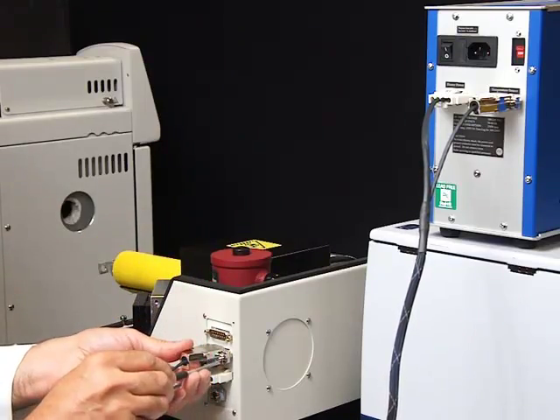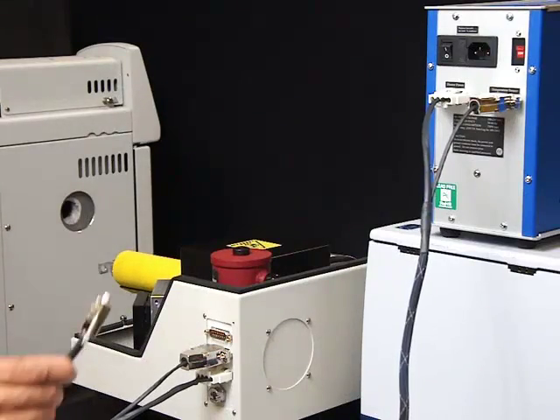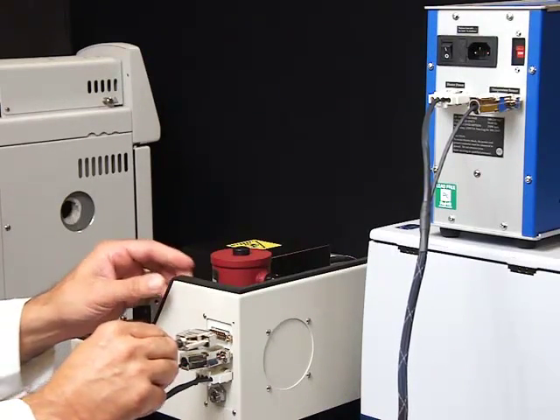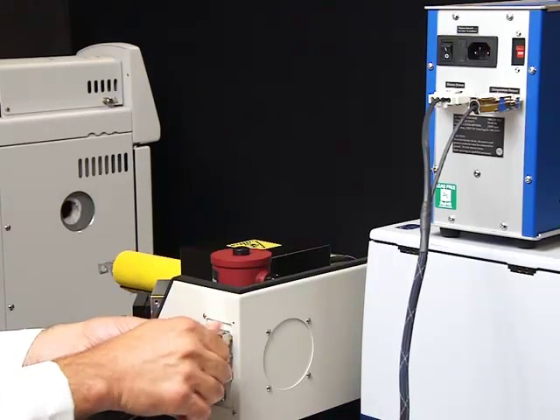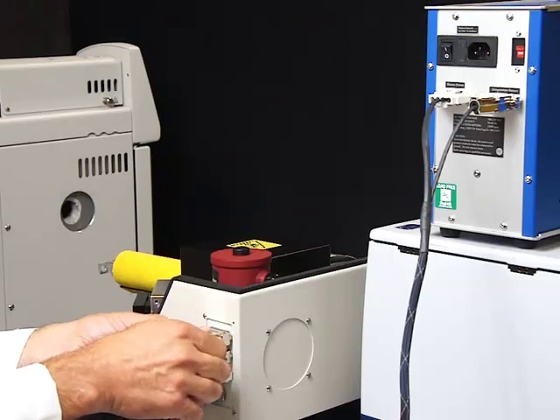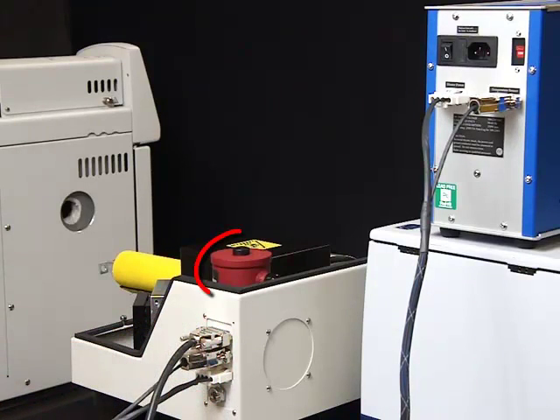Connect the external detector as required by your system configuration. Fill the MCT detector with liquid nitrogen. This process is illustrated in a separate video.